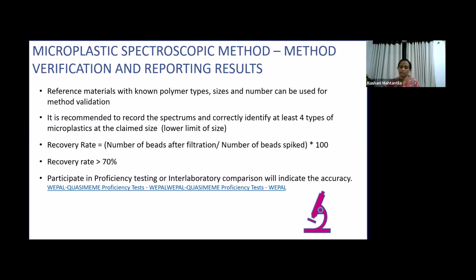And there's another way that we can analyze whether we are doing accurately or not, which is to participate in proficiency testing or inter-laboratory comparison. There are some proficiency testing providers accredited under the 17043 standard. They have higher analytical facilities than us. So they prepare the sample, and they test it for homogeneity and stability, and they define a period.